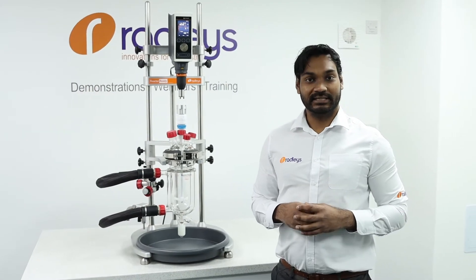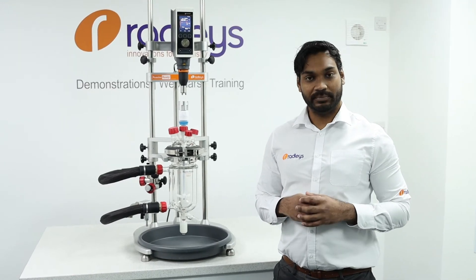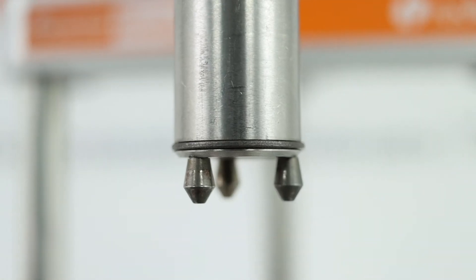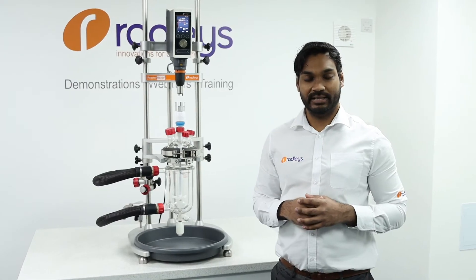With Reactor Ready, the impeller doesn't connect directly into the chuck of the overhead stirrer. Instead, the drop-in coupling has three vertical pins which engage with the three horizontal pins in the stirrer guide in order to rotate the impeller.